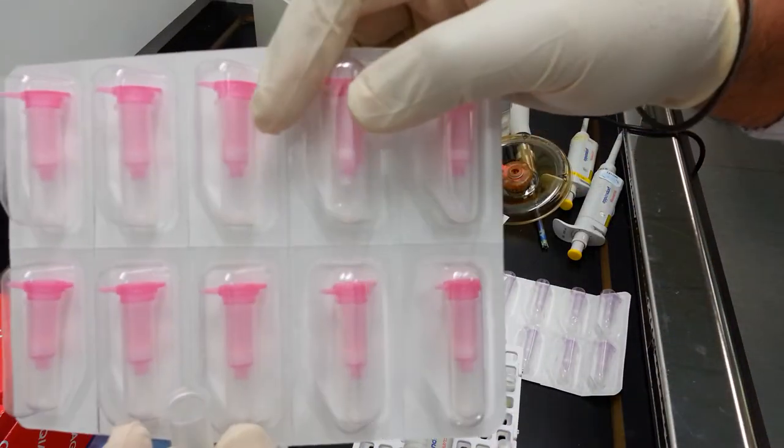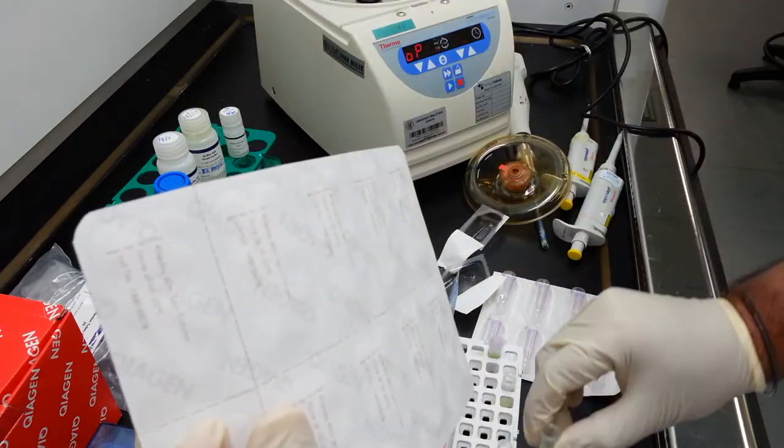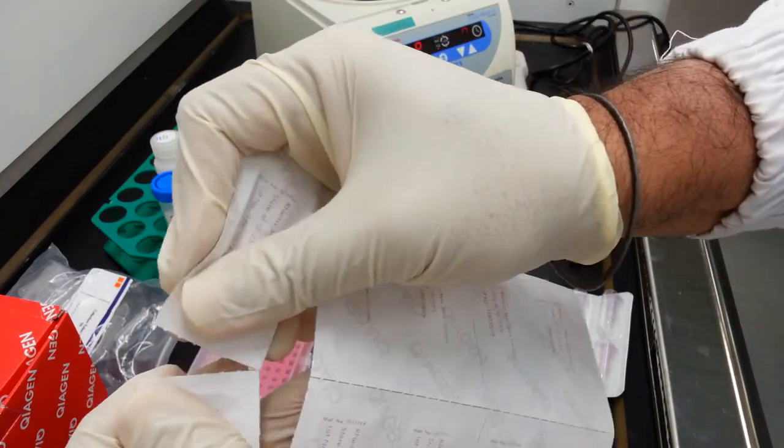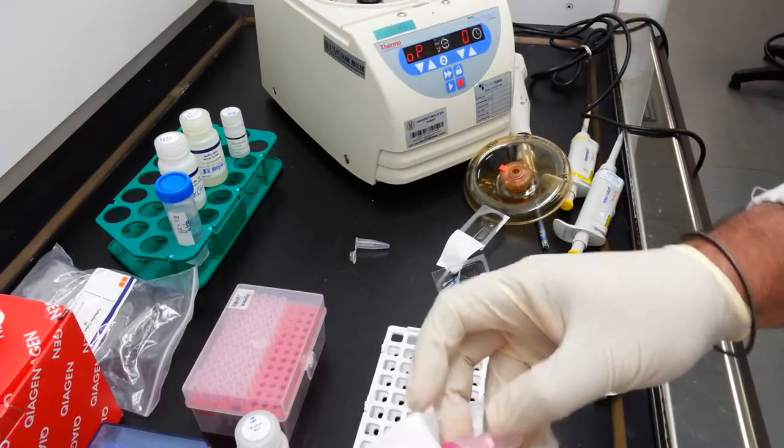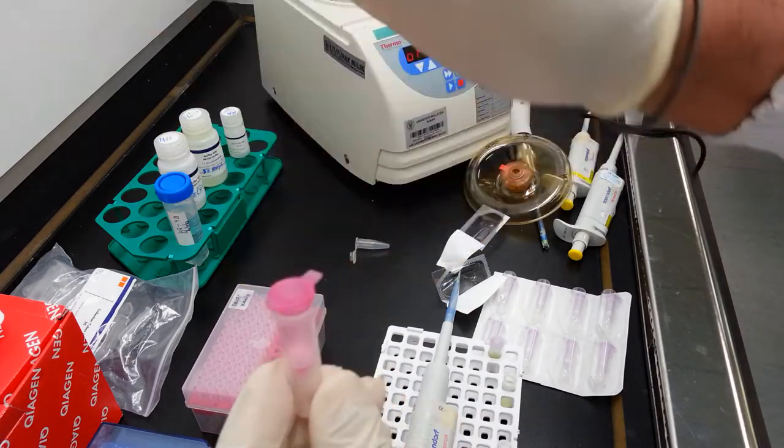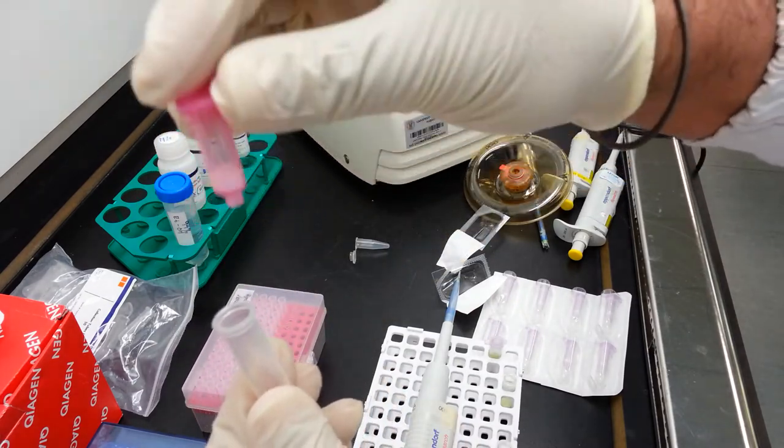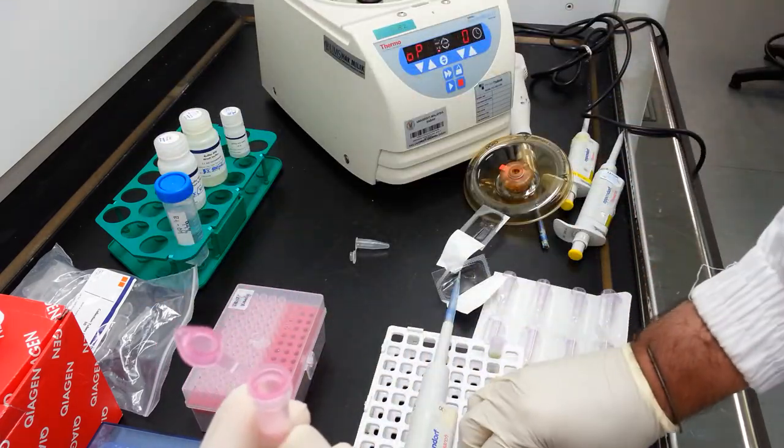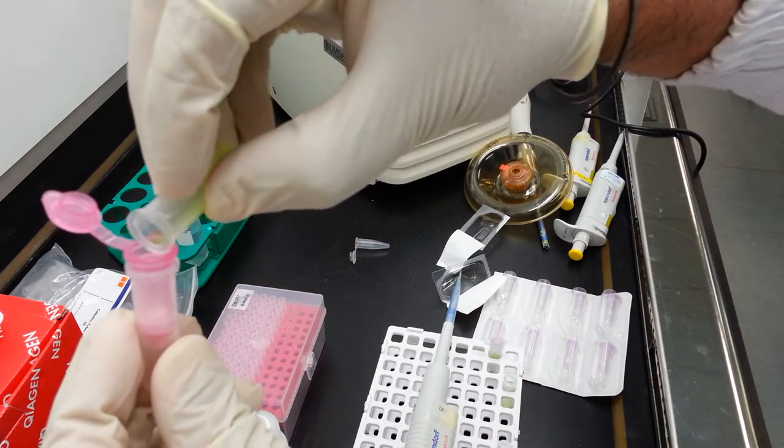Now the RNAeasy kit is equipped with this pink column, which is called a RNAeasy mini spin column. This column consists of two parts. The lower part is the collection tube. The upper part is the membrane containing element. Transfer this mixture into the collection tube.